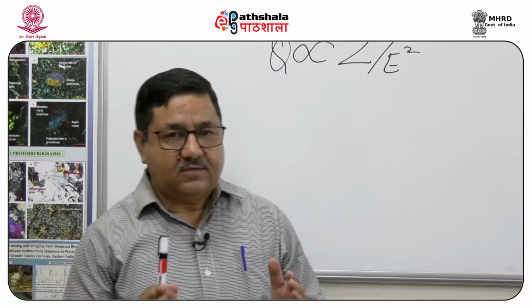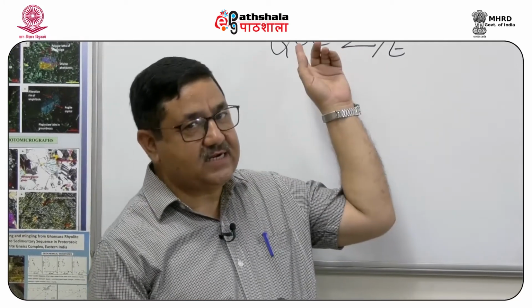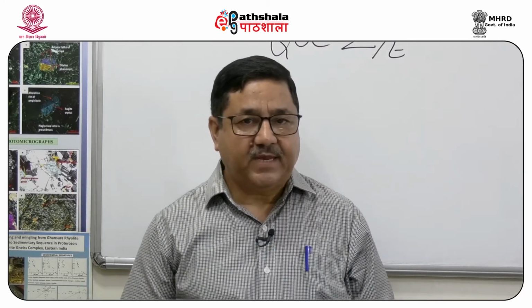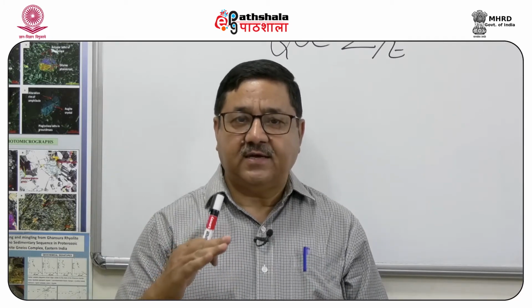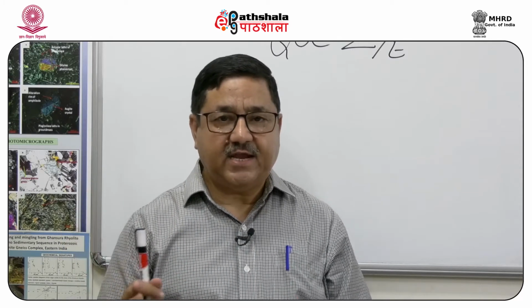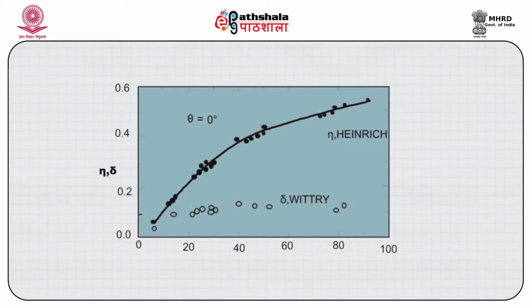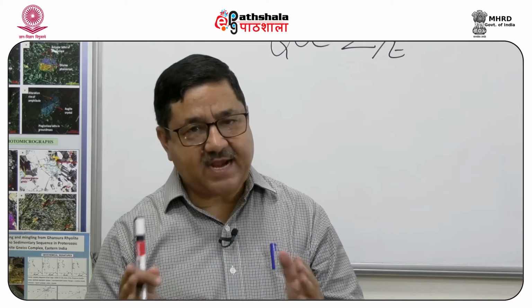Now, the elastic scattering will be higher for higher Z or higher atomic number elements, which means that if we have a recorder which can record the scattered electrons, then for higher atomic number it will record a higher number of electrons, for lower atomic number a lower number of electrons. And if we get this in the form of a gray tone image, we will be able to distinguish the brighter parts as higher atomic number.